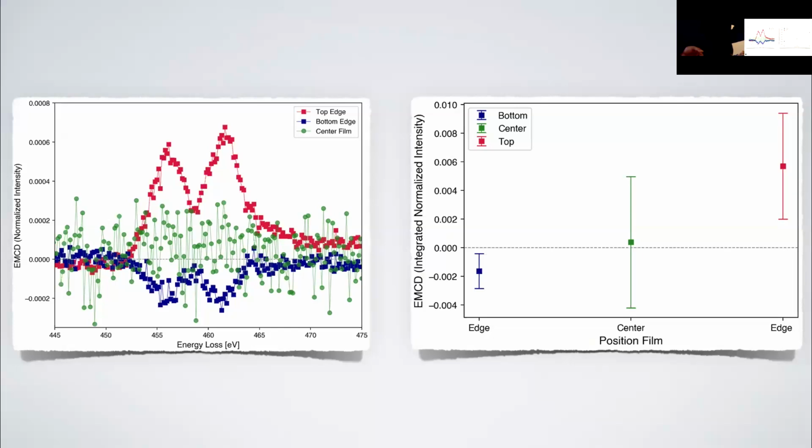The fact that you don't observe a decay of the magnetic signal inside the film, could that not be a fingerprint that the magnetization you are observing is due to the Ørsted field, due to the current flowing? Because you have a current flowing, so you have Ørsted field, and your sample is under a magnetic field. It has some magnetic susceptibility, so it gets magnetized.